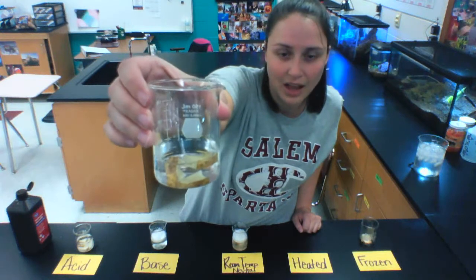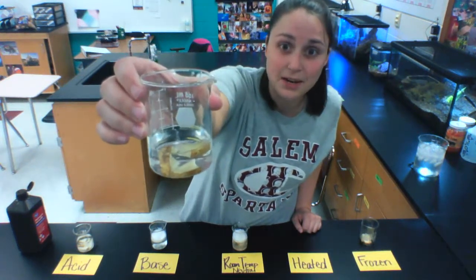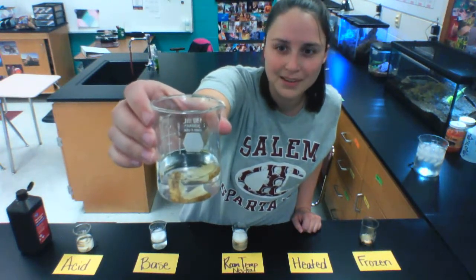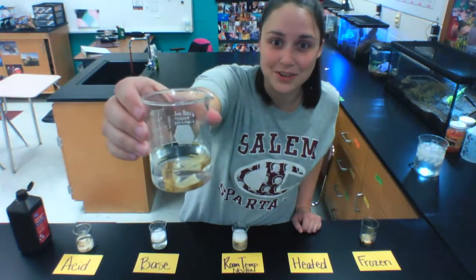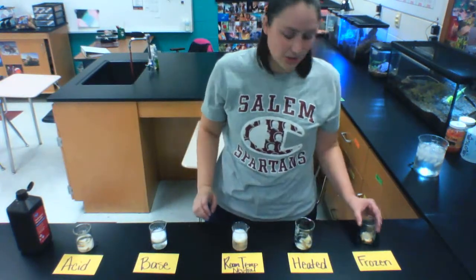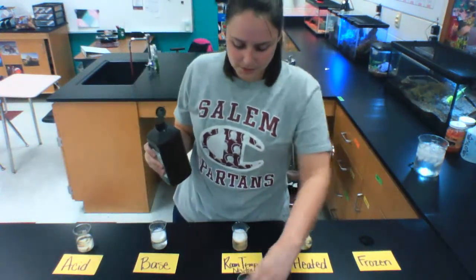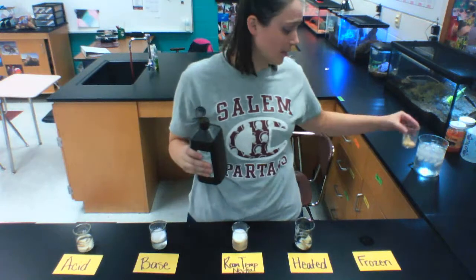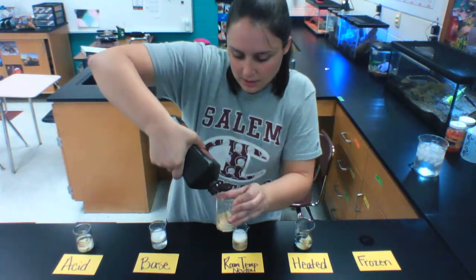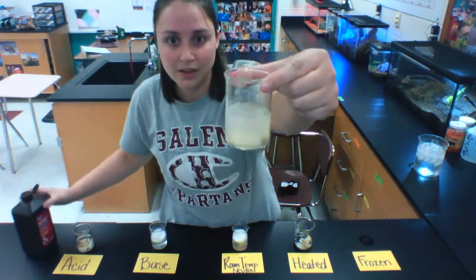So I'm not seeing a lot of reaction from our potatoes that had been in the microwave, that had been heated. What did that temperature do to that enzyme? There's a word. It's called denatured. Last but not least, let's check out our frozen potatoes. These are our frozen potatoes. They were in that ice bath over there getting nice and cold. And let's see what happens here. All right, I've covered them.